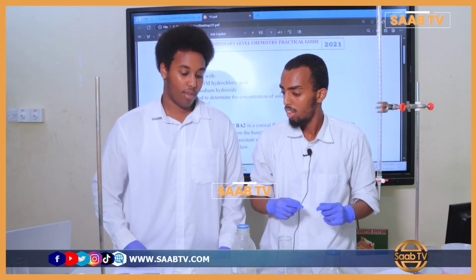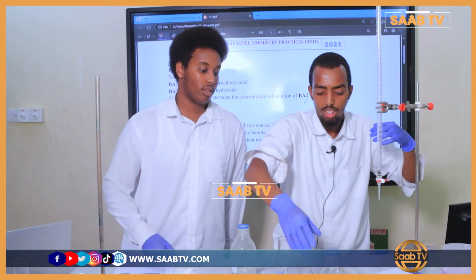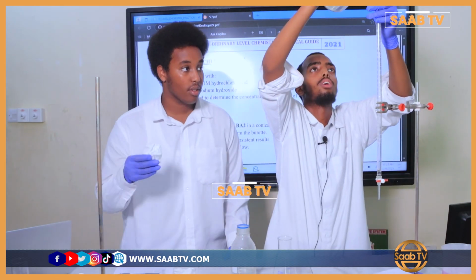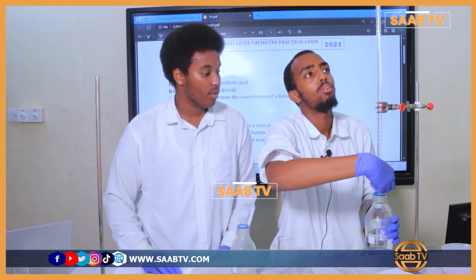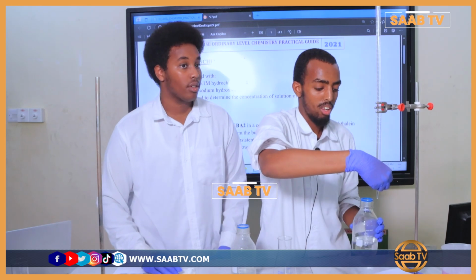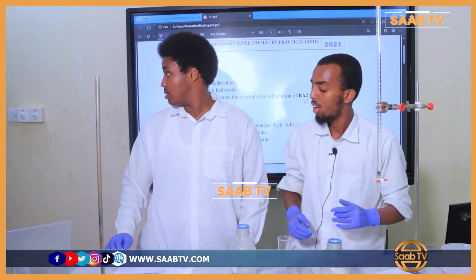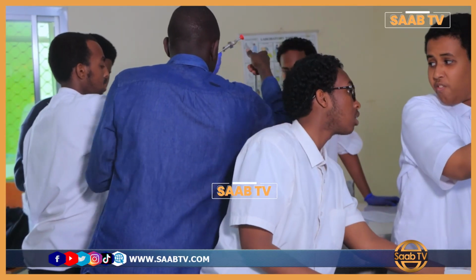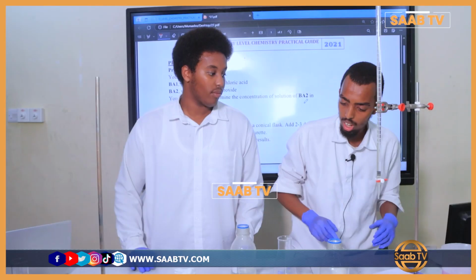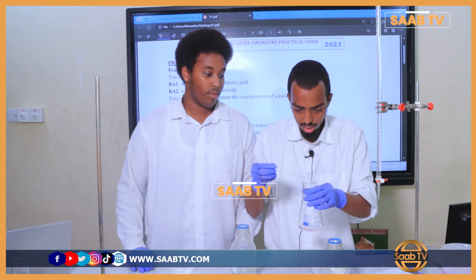It's time for the acid. So we get a funnel and place it on top of a burette. Pretty easy. Then add the acid. Now we're trying to make it reach that zero mark. It's just a little bit more. That. So now we first record the initial reading. The initial reading is right now 0.00. Okay? Now we add 2 drops of phenolphthalein.